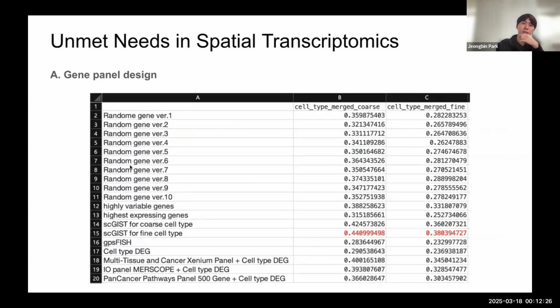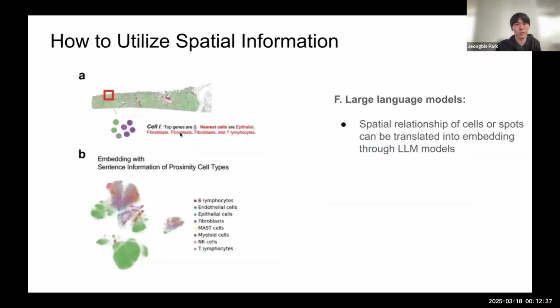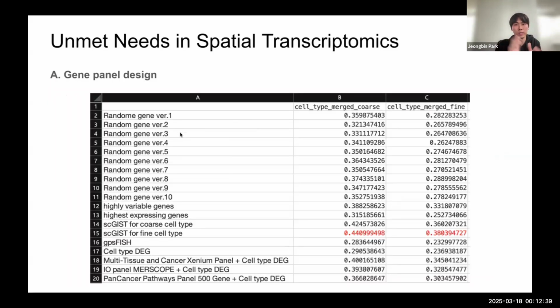And this is my personal experience, my benchmarking research. Let me tell you more context. As I mentioned, the language models, right? We can think of the cell type classification accuracy from a panel-size transcriptome. The cell type annotation is based on whole transcriptomics.